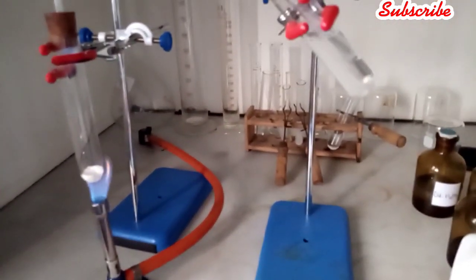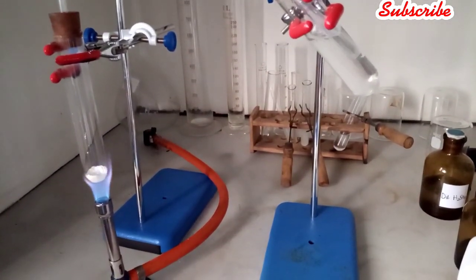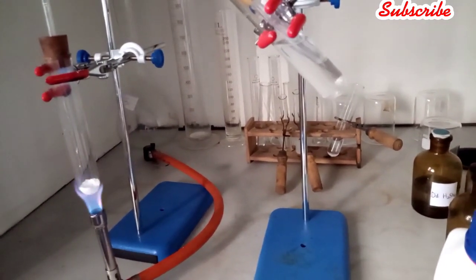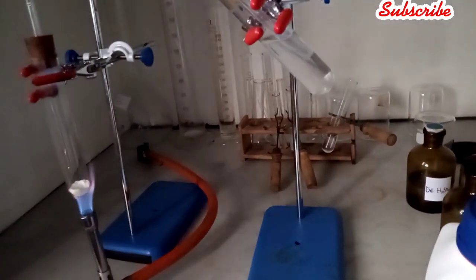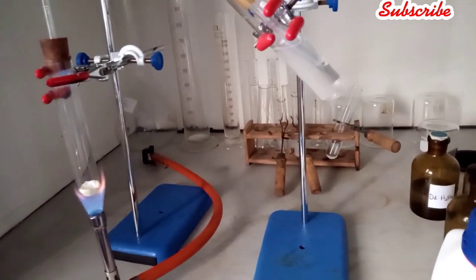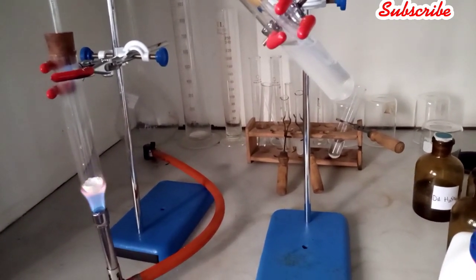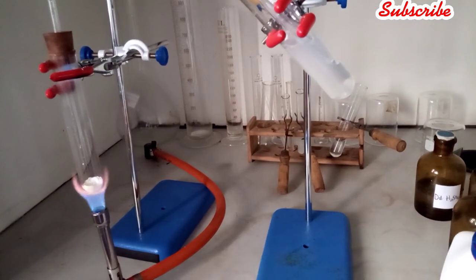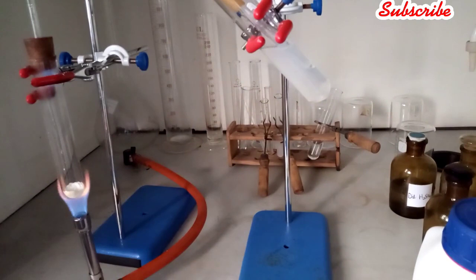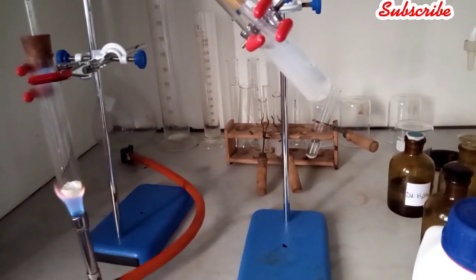So you observe as it's boiling, it's decomposing to give you zinc oxide and carbon 4 oxide gas. Now the effervescence of this gas, when passed through lime water, turns the lime water milky. And then the zinc carbonate turns from white to yellow when hot and back to white when cold. You can observe the lime water is turning milky now as a result of the effervescence of carbon 4 oxide gas.